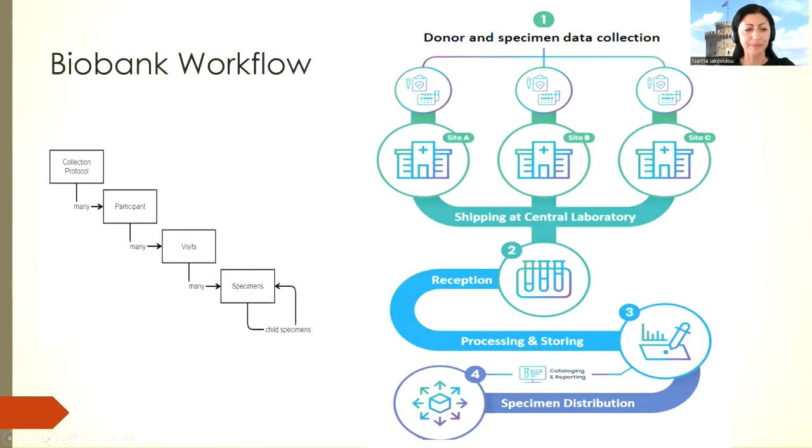On the left, you can see the well-known OpenSpecimen hierarchy, and on the right, there is the general biobank workflow that we follow in our case. First of all, I have to mention that it is only after the donor signs an informed consent form that this workflow begins. The first step of the biobank workflow includes capturing information by the nurses regarding the personal, contact, and demographics data of the participants, and also several clinical, physical, and socioeconomic information.